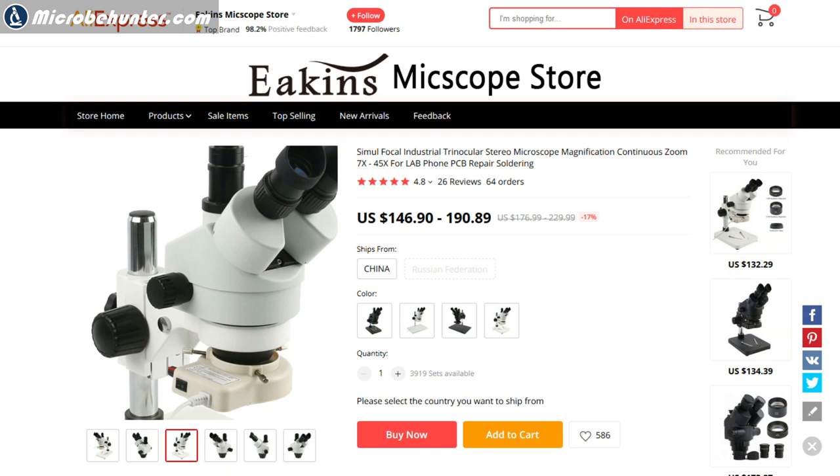Moving on to budget and brand. You said 200 to 400 pounds — that will get you a decent microscope, like this one, which cost around 400 euros, so it's within your maximum budget. The brand on this is AmScope, however this microscope is manufactured in China and imported, then sold under different brand names by different companies. If you go to AliExpress, you can buy these microscopes quite cheaply imported directly from China — they look almost identical.